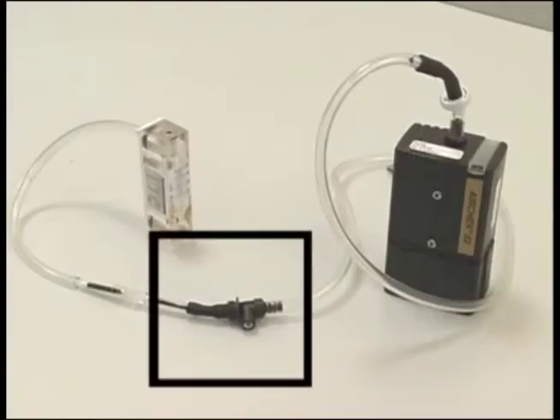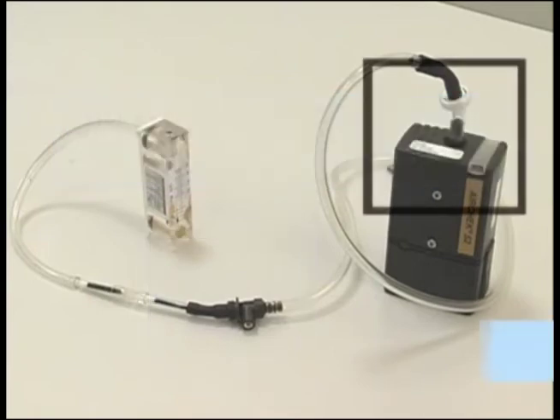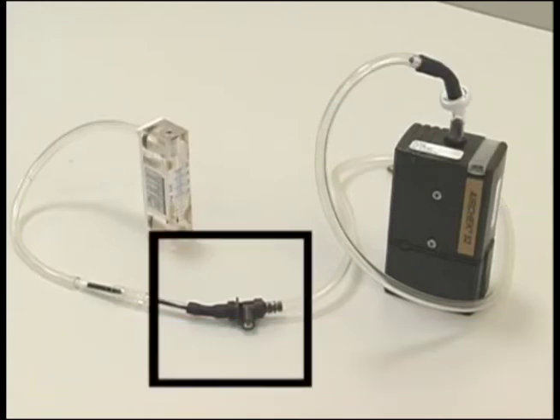This setup uses an adjustable low flow holder. This allows flow adjustments in the low flow range between 0.10 and 0.50 liters per minute. Do not adjust the pump itself at any time while verifying calibrations. Only the low flow holder should be adjusted.